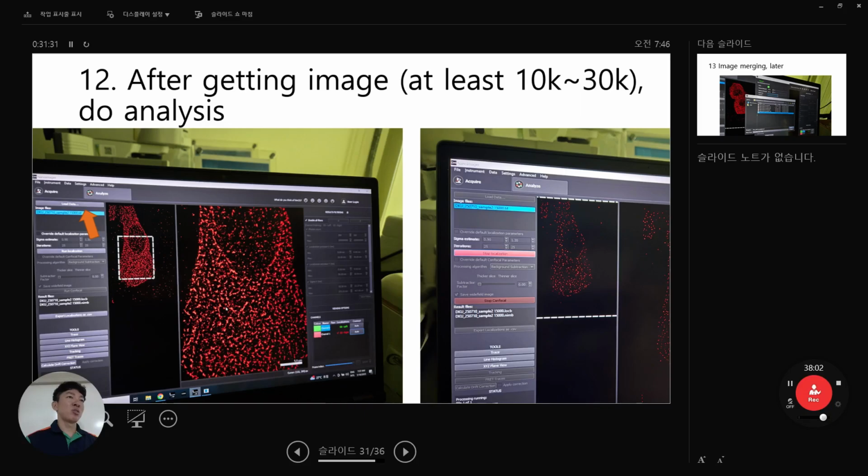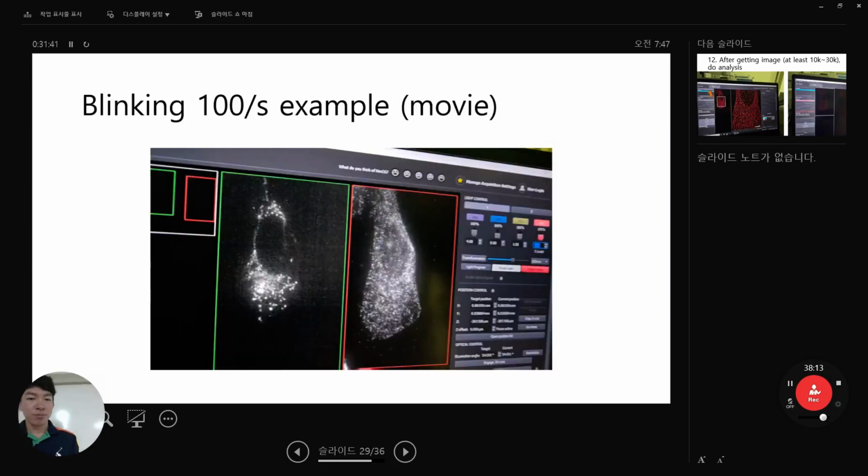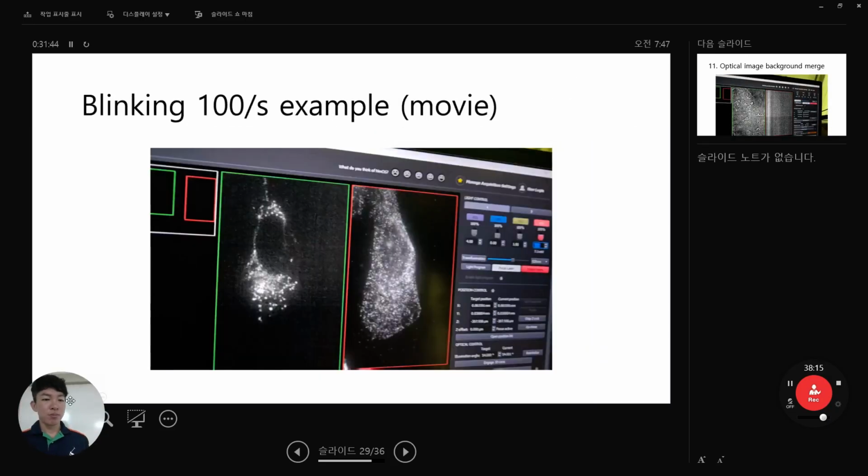Okay, any question? You showed the video. Is it taking two pictures of two different stains simultaneously or just one by one? Yeah, it's a good question. Actually, at the moment, we are staining two, say, green and red, and then we visualize together.